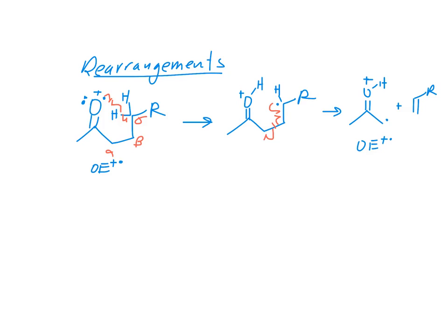Right? So another way that a ketone like this could cleave would be the normal, non-rearrangement alpha cleavage. So we're just contrasting.